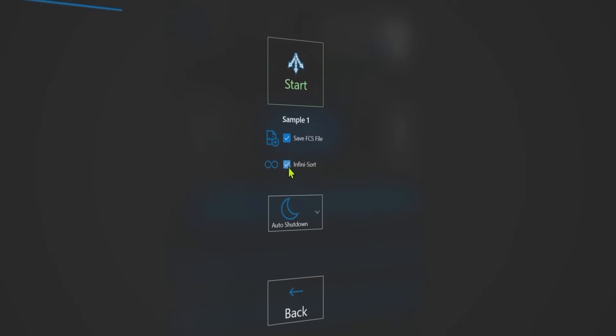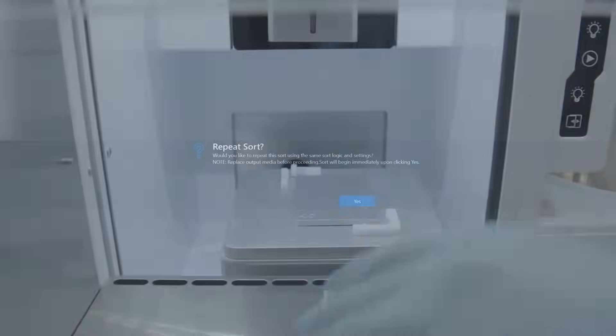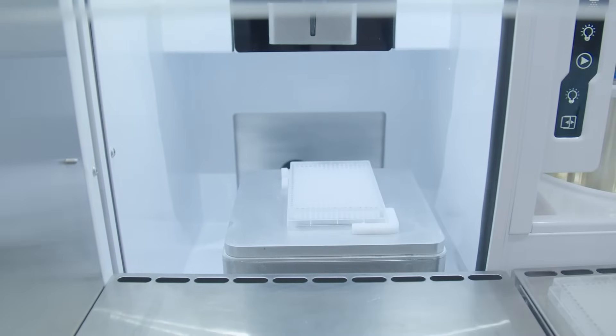For bulk sorts, the Infinisort function of the InvitraGen Sasquatch software can be activated to perform multiple tube or plate sorts back-to-back.